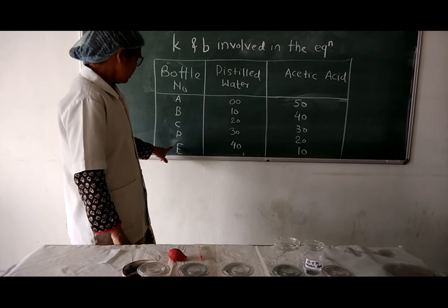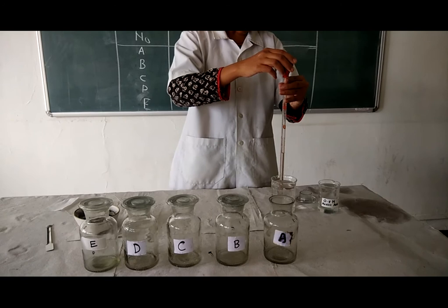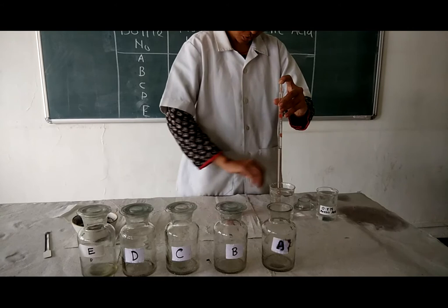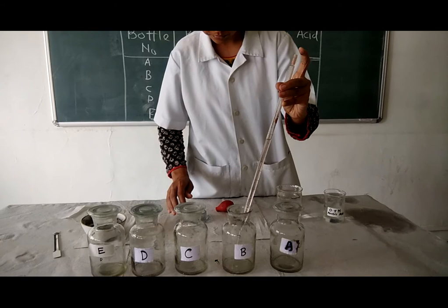Now first of all, I am adding the distilled water. No distilled water is needed in the first bottle as it is 0 ml. In bottle B, I am adding 10 ml distilled water.